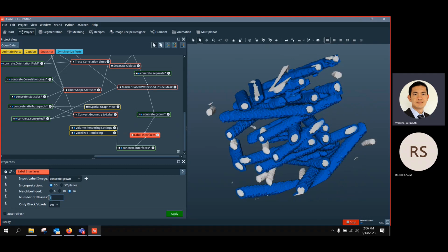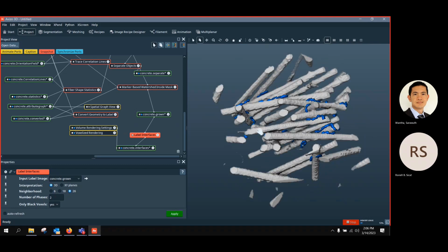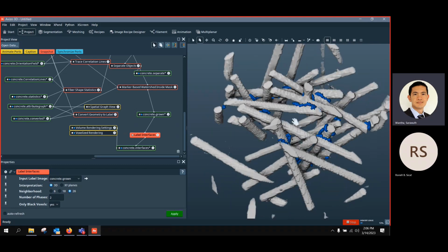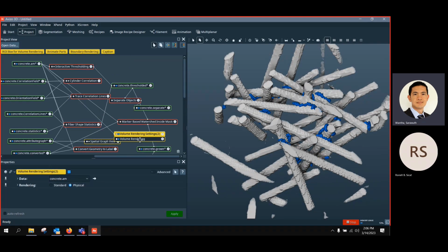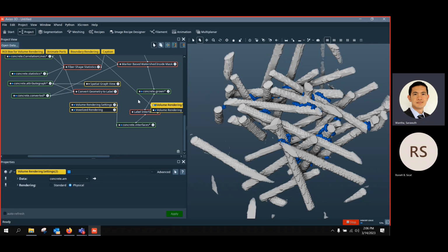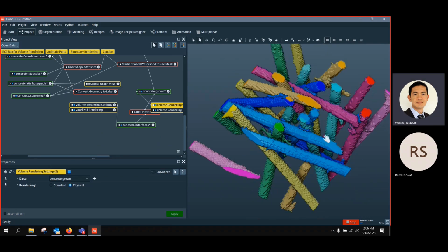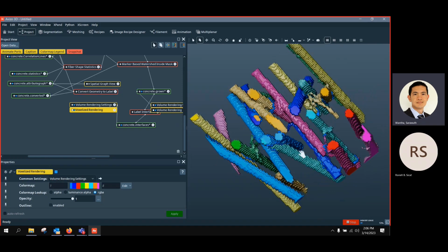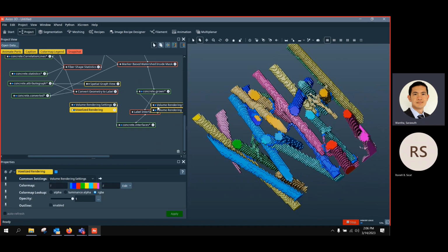Mostly you just look at the 2-face interface like this. Then you get the information of the contact face between the 2 labels. Or instead of grayscale, you can look at this one. I hope you see what I display.